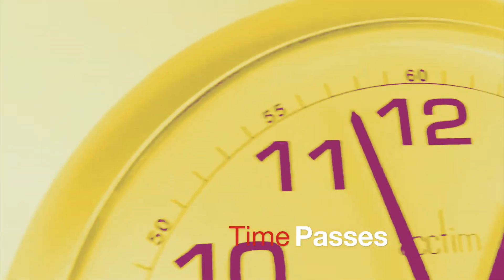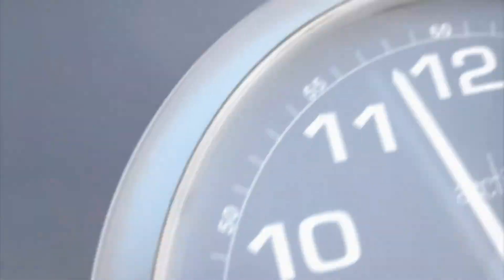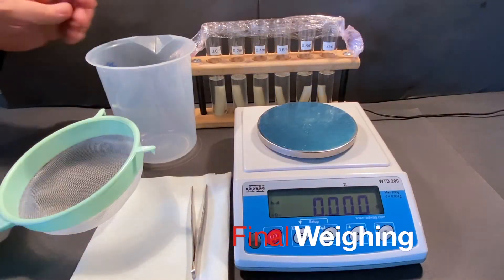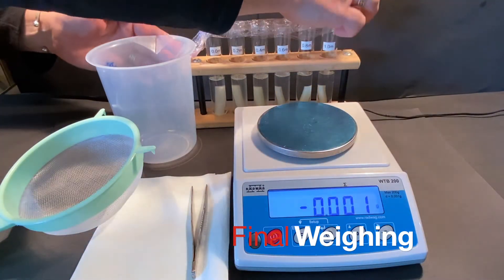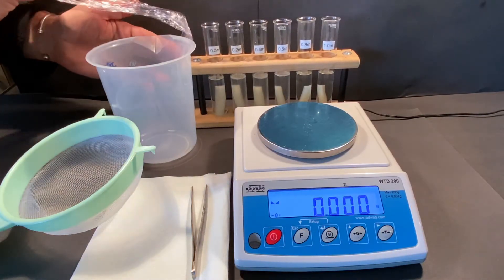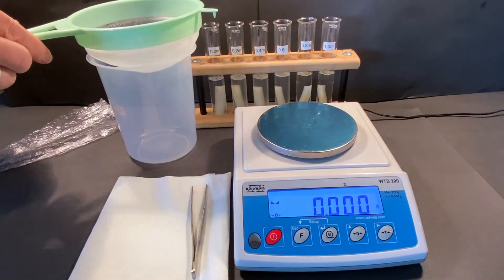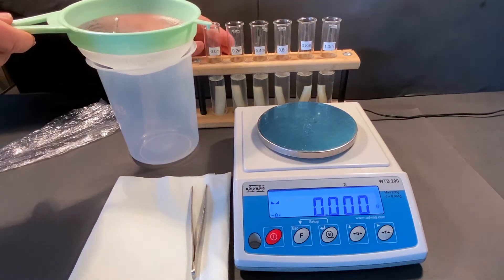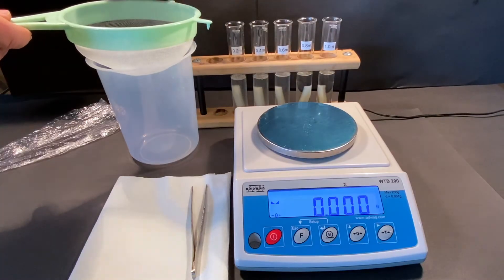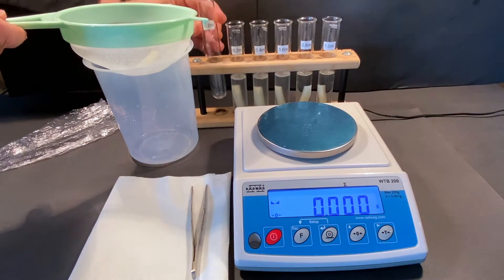24 hours later you will be able to re-weigh your samples. Following the same processes as the initial weighing, take the final weights of the potato samples from each concentration. As each raw data weight appears there will be an on-screen graphic to associate it with the correct concentration.